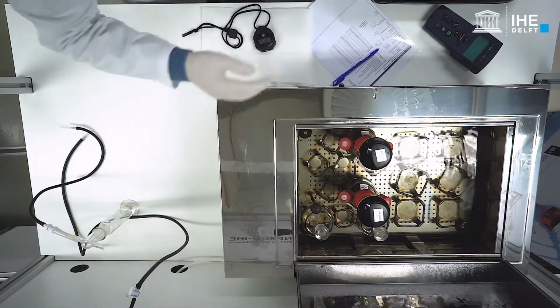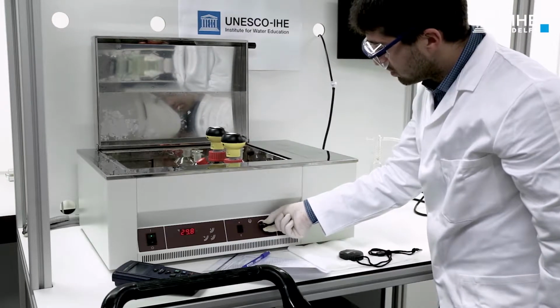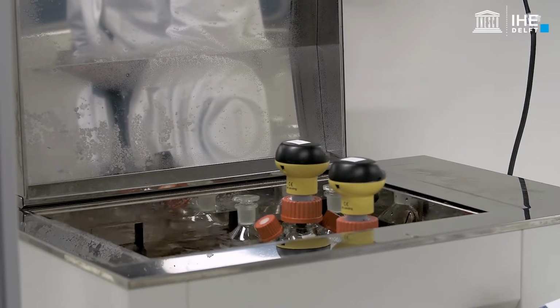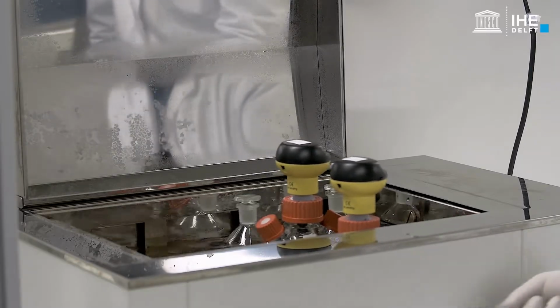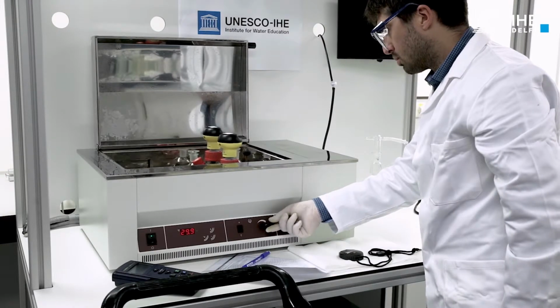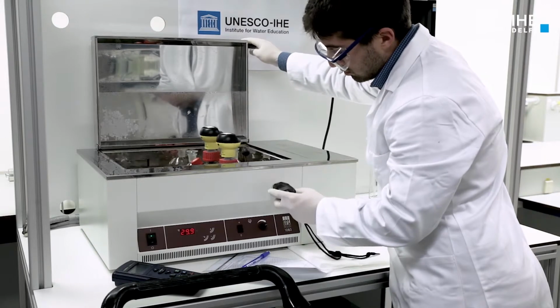Check that the temperature of the control system is at the desired set point value. Typically, values between 30 and 35 degrees centigrade are adequate. In principle, to get a representative assessment of the kinetics, the temperature set point should be similar to the temperature observed at the plant where the biomass originates from. In this case, a temperature set point of 30 degrees centigrade was selected.